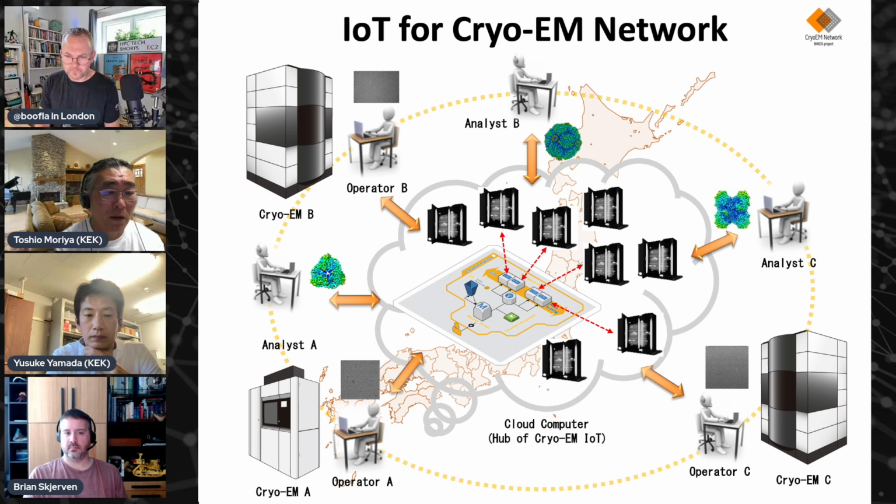Then we can make the usage of the CryoEM much better. And on top of it, we can accumulate all our experience, knowledge and data on the cloud system. So yeah, this is very unique to the Japanese needs. I'm not really sure whether the US or Europe need this kind of system, but at least for Japan, it's really necessary for us.